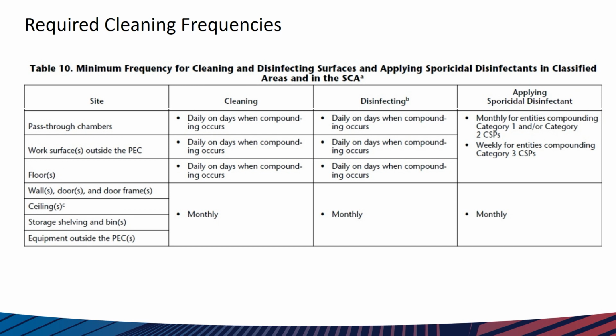If we want to validate cleaning processes with a surface sampling, they might have to take their room down to run through that procedure. Or you mean if you recover things? Okay, and I'm hesitant again to use the word validate because very few of us in this room validate anything in the true sense of validation.